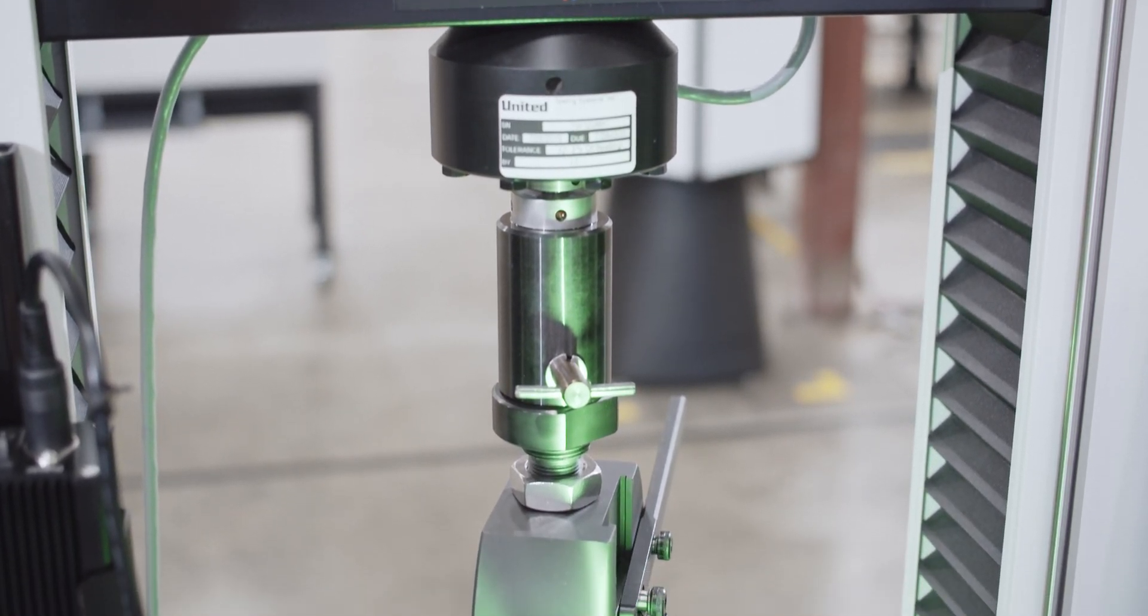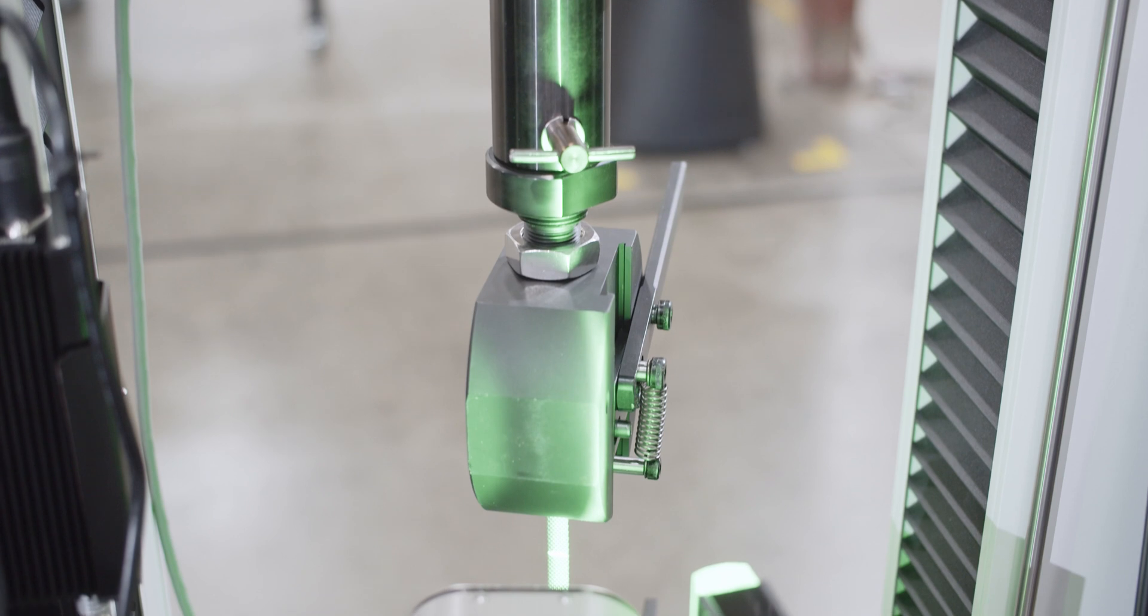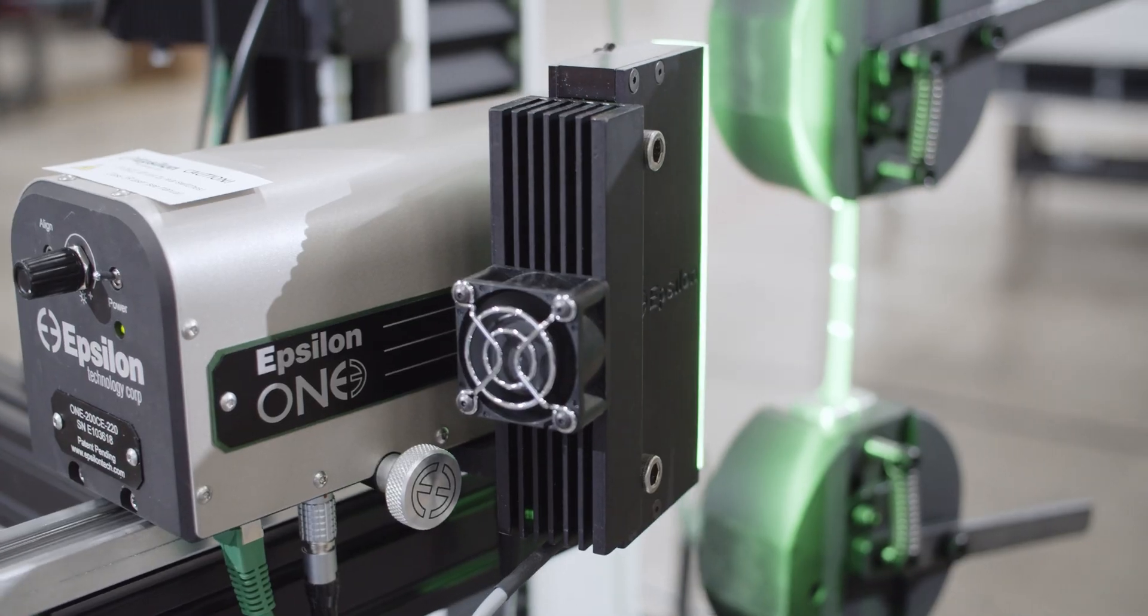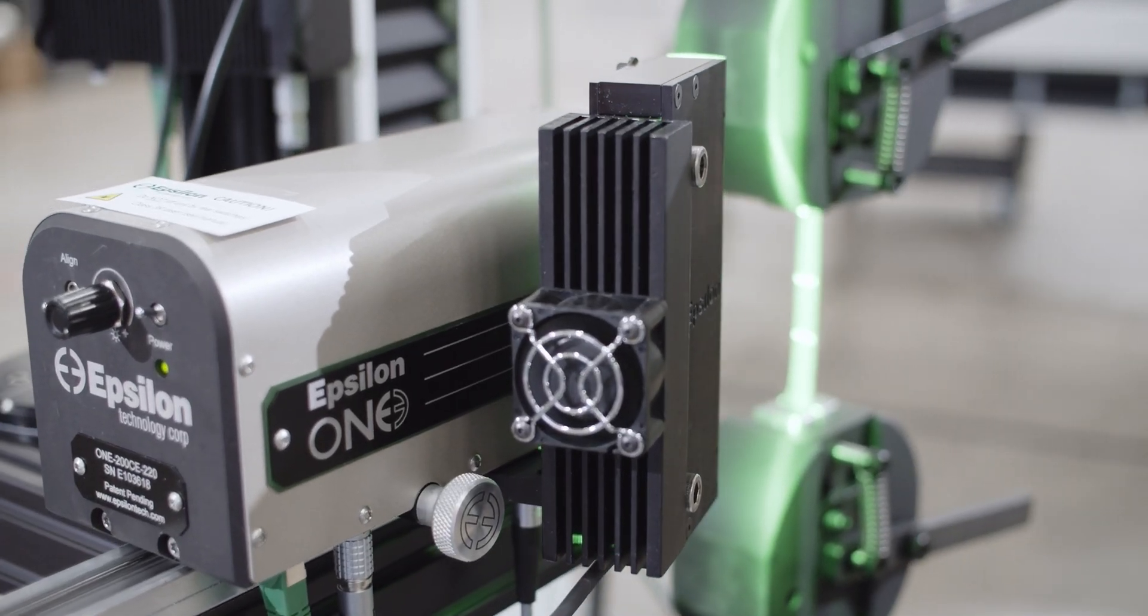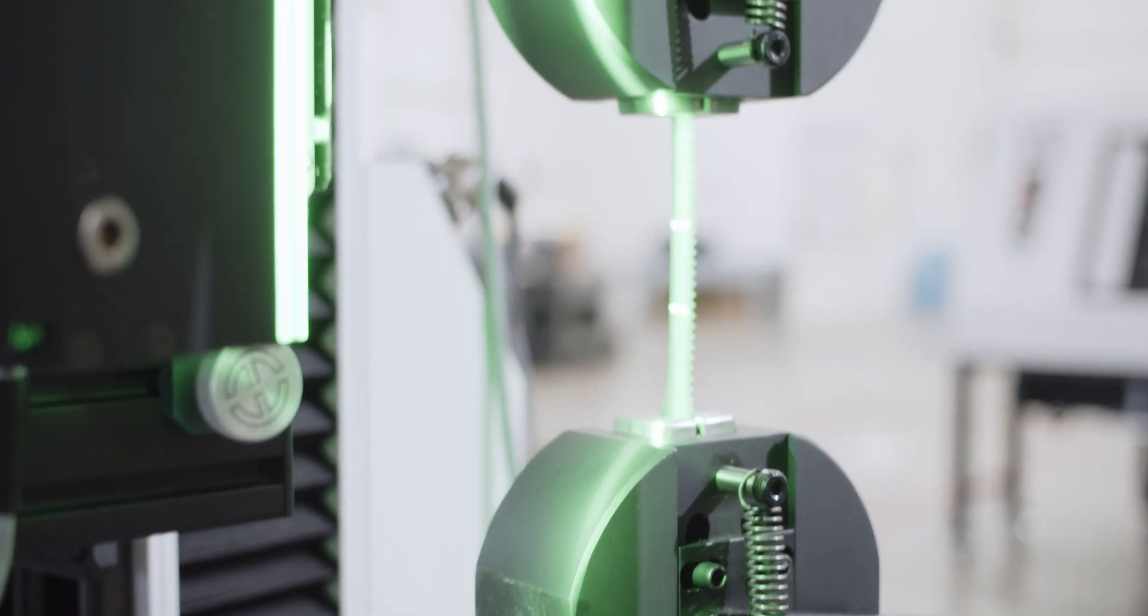A United universal test machine, along with the EP1, is ideal for testing a variety of materials. The system's high resolution makes it suitable for non-contact measurement of a wide range of strain values.